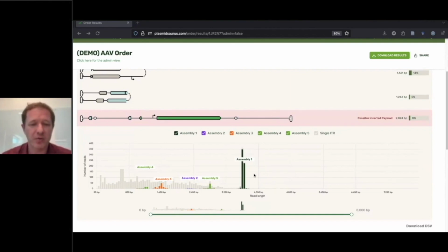And then with those reads, we'll identify peaks within the histogram. Presumably, these reads all represent a single genome. And so you can see here we have one fairly large peak that's right around 3.5 kb. And then we will take these reads and do an assembly with them to see what that genome is.